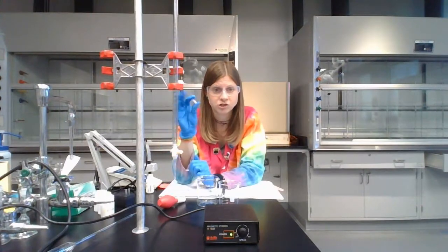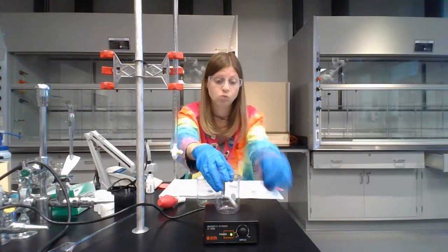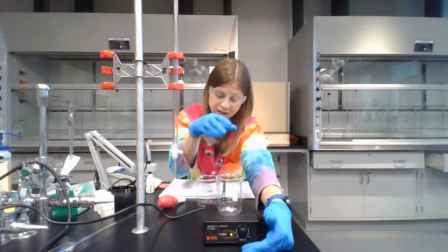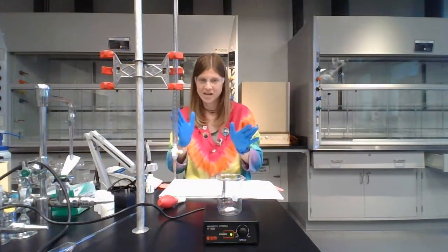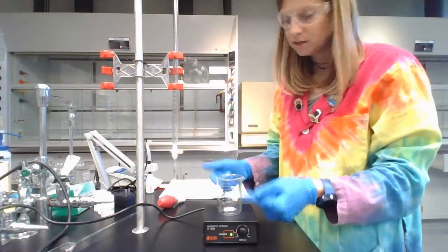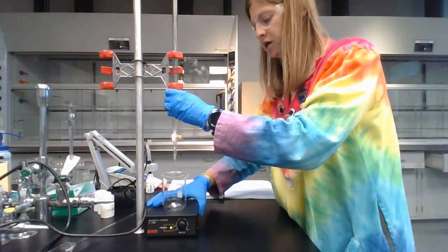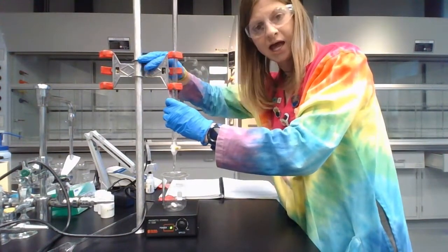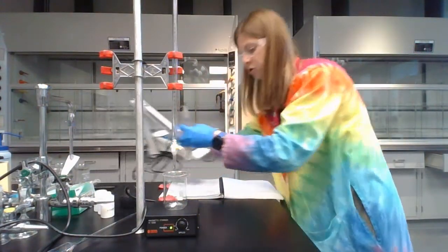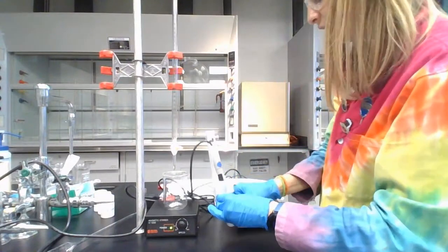Now, since we're doing a titration, we will need a stir bar and a stir plate. So the stir bar, we place on, already on, got excited there. You'll need to turn on the stir plate, but you will have to get all this set up very carefully. So we're going to need the solution with the weak acid with the stir bar stirring. And we're going to have to move the stir plate with the beaker till it's underneath the burette, so the tip of the burette's just inside of the beaker. But the other thing that has to happen is our pH meter has to be submerged into the liquid as well. So you will follow the instructions on how to correctly rinse and use the pH meter.